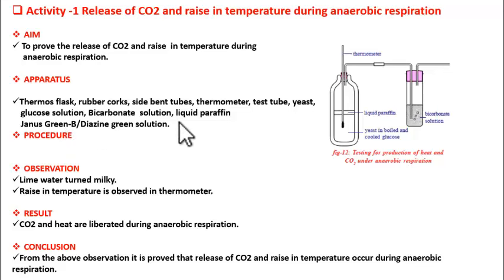It is a dye, students. It is an oxygen indicator too. This is blue in color normally, and when there is no oxygen it turns into pink. Got it? So these are the apparatus required.